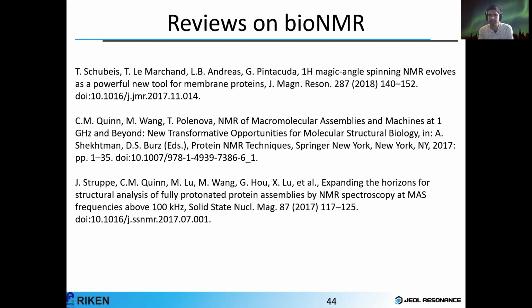Right. So the next question is from Professor Bodenhausen. Can you elaborate why some 14N indirect detection methods are found to be better than others? Okay. In the case of direct detection, it's quite difficult to observe because of the presence of the large quadrupolar coupling. For example, if we simply observe nitrogen-14 with a single pulse, we don't see anything, even for glycine. Glycine has a small quadrupolar coupling, it's only about 1 megahertz, but this is too big.